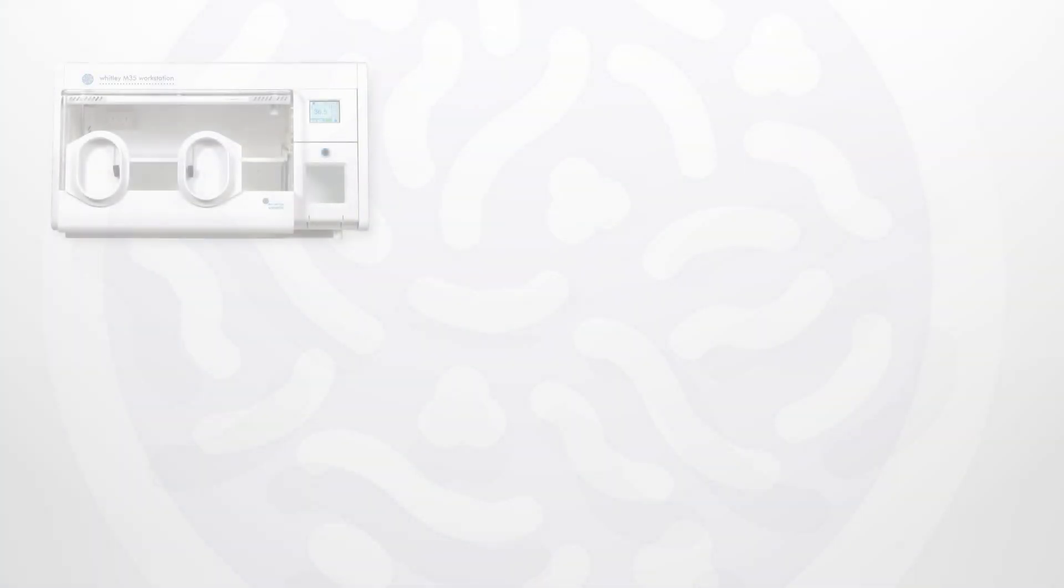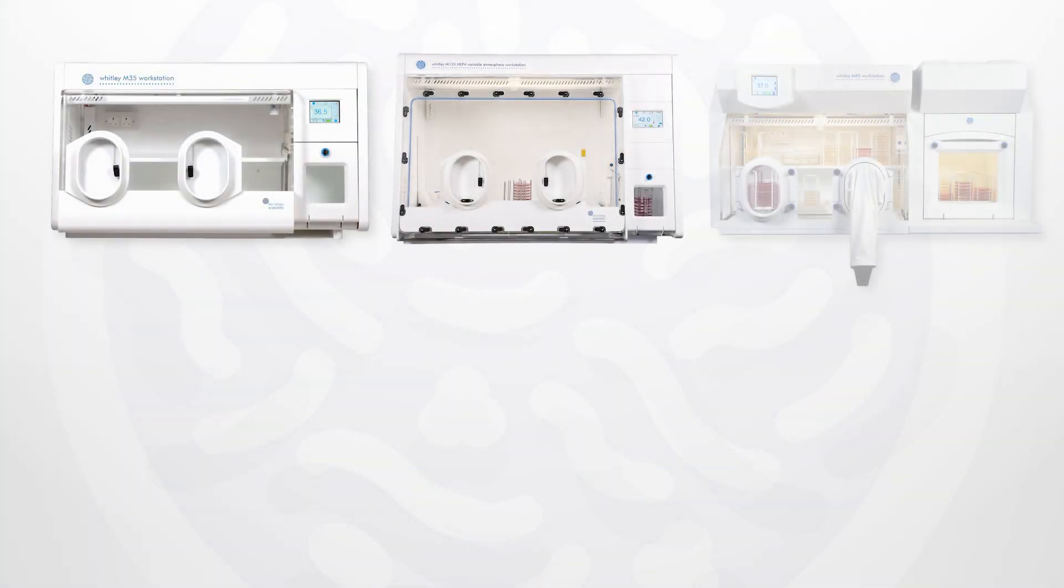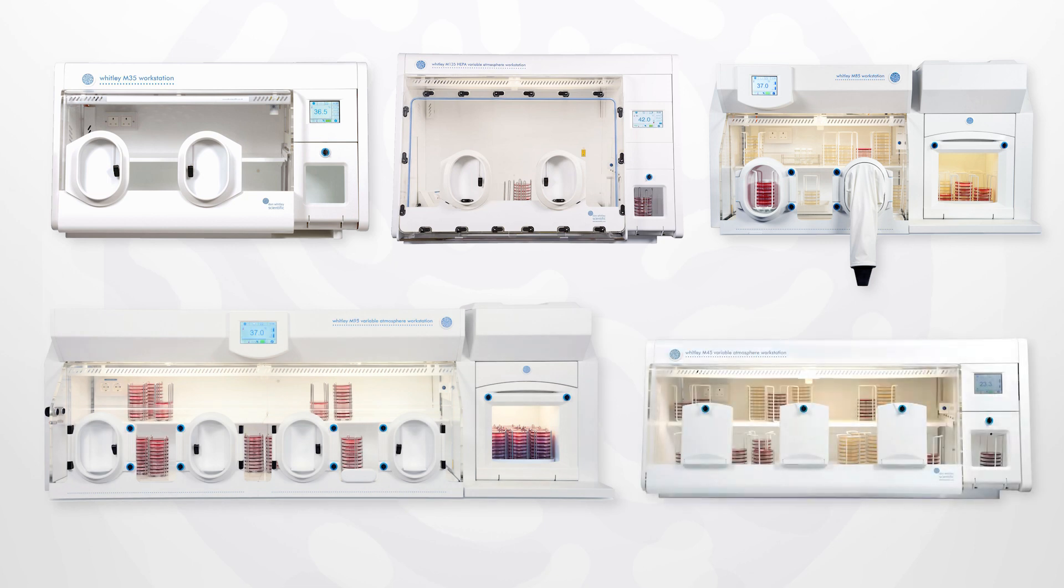At Don Whitley Scientific, our engineers and scientists provide the expertise and experience to ensure that Whitley microaerobic workstations remain the first choice for scientists around the world.